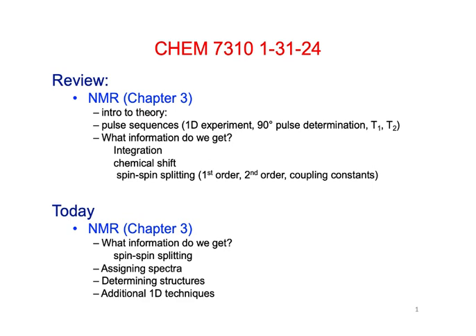And then we're going to look at just a couple more techniques. They're a little bit different than what we've done so far. Okay, and then that'll pretty much finish up our initial discussion of just one-dimensional proton NMR. And then the next thing after that will be C13 NMR. Okay? All right, so let's start in.